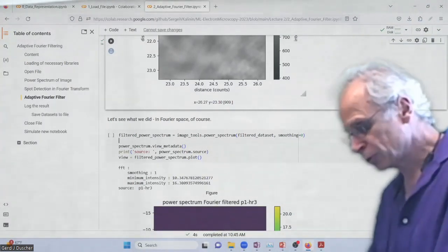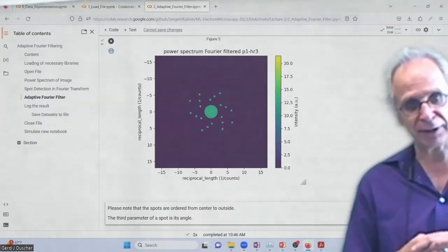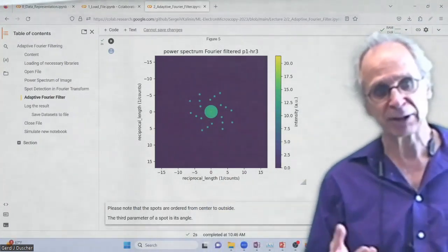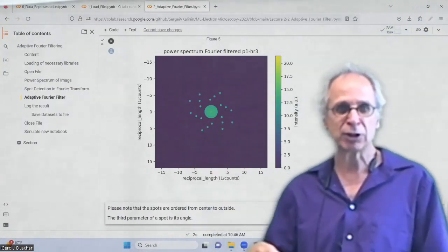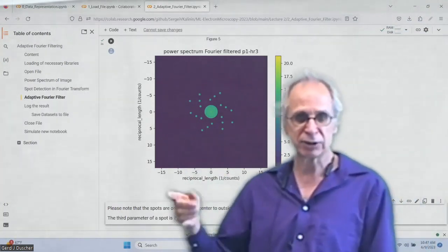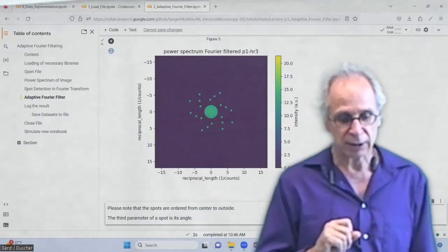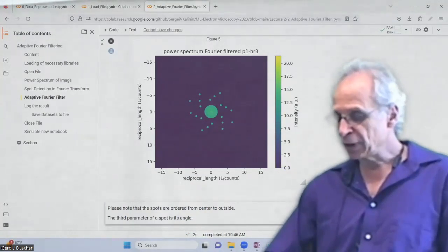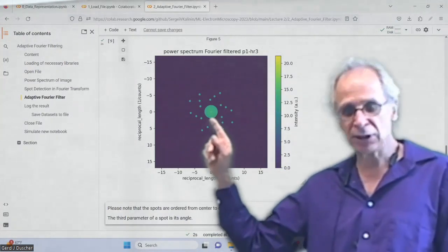First, we want to see what we really did. So as soon as you do the filtering and you publish that, people will do an inverse Fourier transform again, and they will see exactly what you did. So always a good idea to be very transparent. I did a Fourier filtering, and in this case, you can say a low pass of this and that many 1/nanometer, and the adaptive Fourier filtering, and so on. So we can check now the size of this inner particle here.